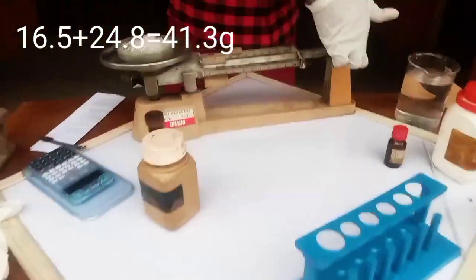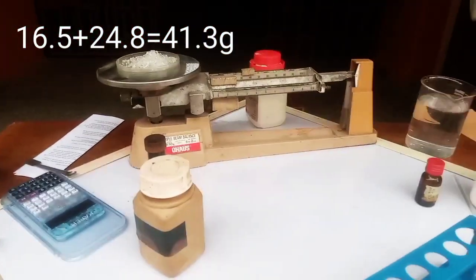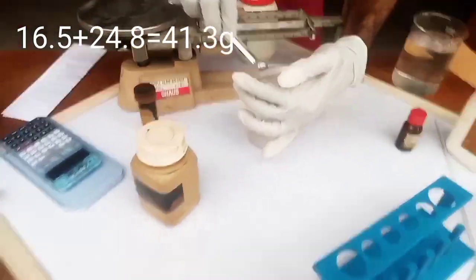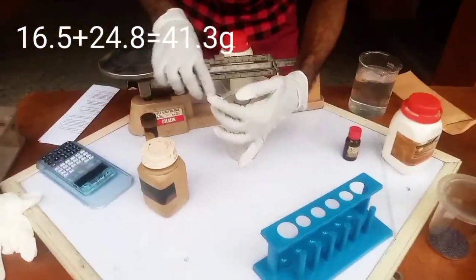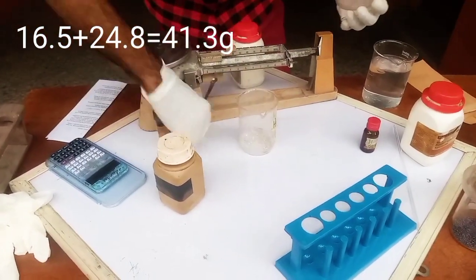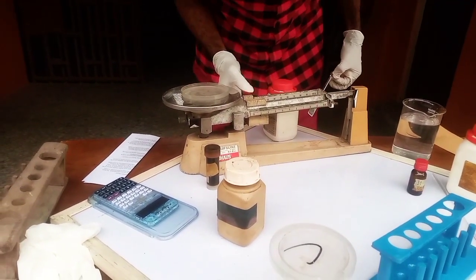I need to put it back to the beaker. I need to put it into a beaker and cover it too, because they actually asked us to prepare this by covering, putting it inside a cork. That is, when you are done with the preparation, you need to put it inside a cork for the student. Okay, the next thing to do is to prepare that of a potassium iodide.